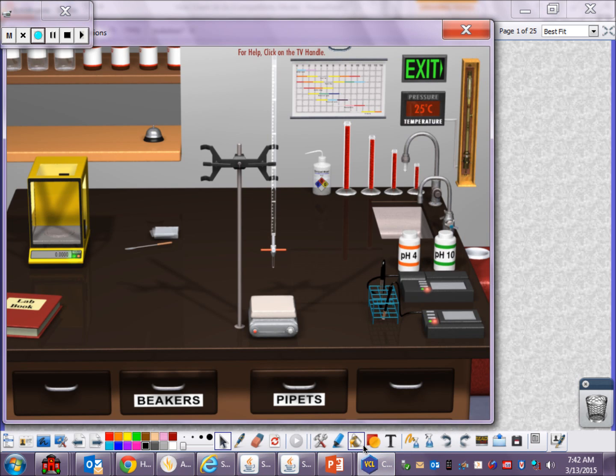Okay guys, today we are going to discuss electrolytes. You will classify compounds as electrolytes by testing their conductivity in aqueous solution. So I need for you to follow with me on your paper, exploring electrolytes.